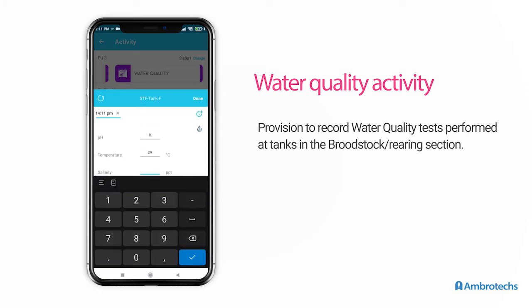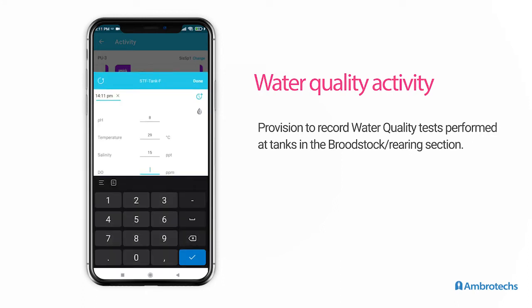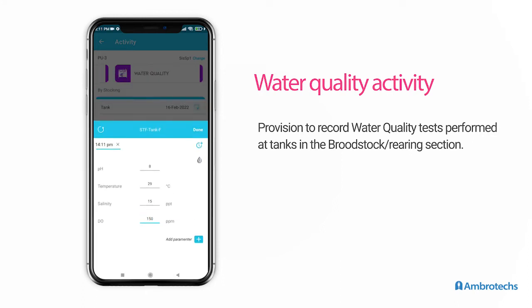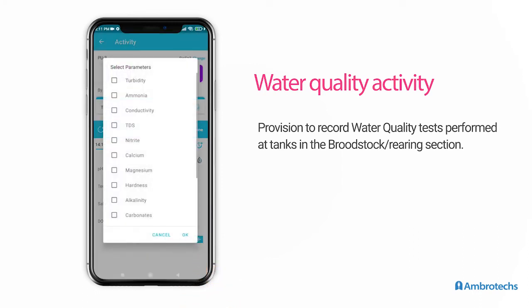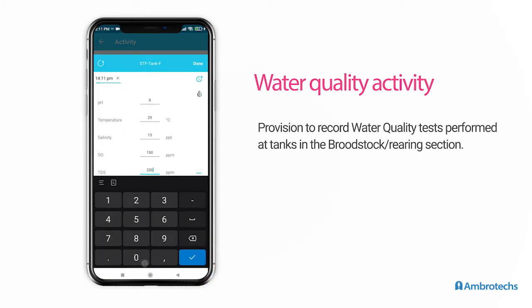Click the Add Parameter button to add any other water parameter. On clicking the Add Parameter button, a list of water quality parameters is shown. Select the required parameter and click the OK button. Now, enter the corresponding values against the parameter.